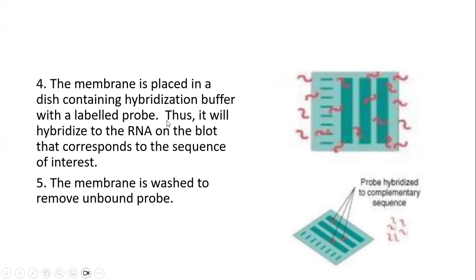Next step is hybridization with a probe. So here also single-stranded DNA can be used as a probe, and it needs to be labeled in some way, maybe radio labeled, chemically labeled or fluorescently labeled, whatever can be used.